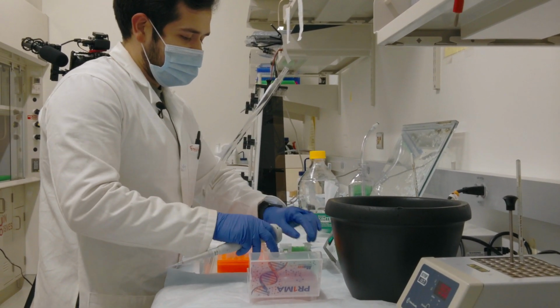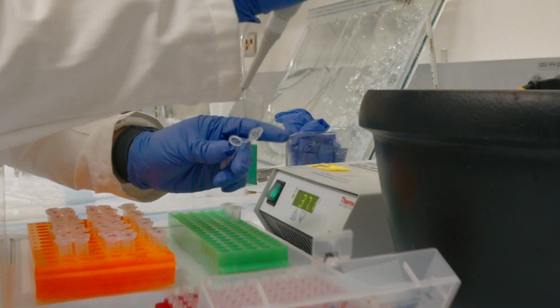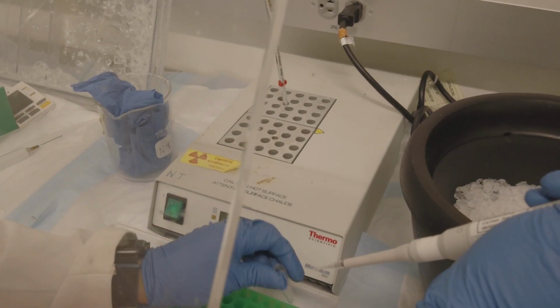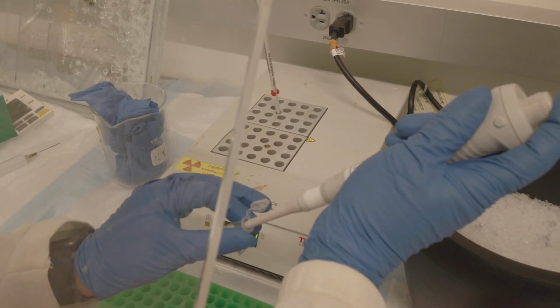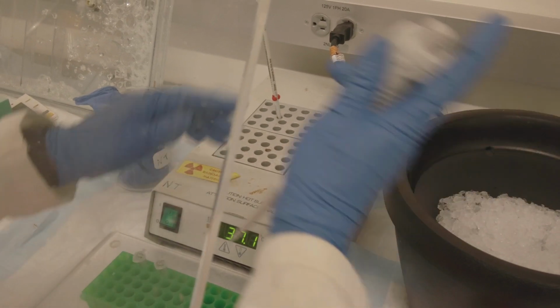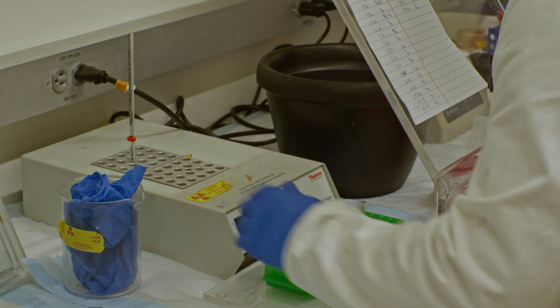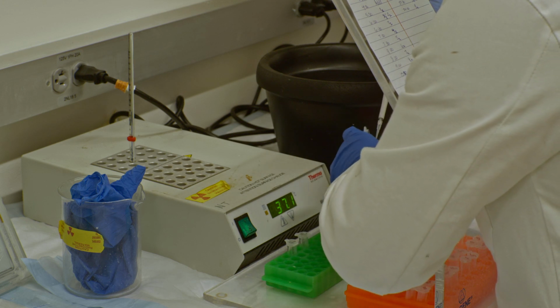So what you have to do in order to anneal your DNA, take out 1 equivalent of your primer, then quickly mix it with 2 equivalents of DNA, and then take that pipette tip and put it over there in the radioactive waste beaker. And then you repeat this again for as many samples as you need to prepare annealed product for.